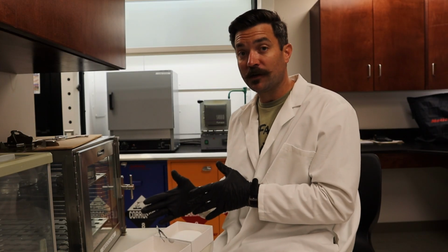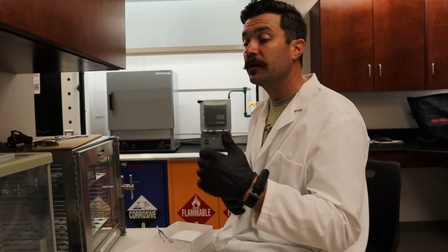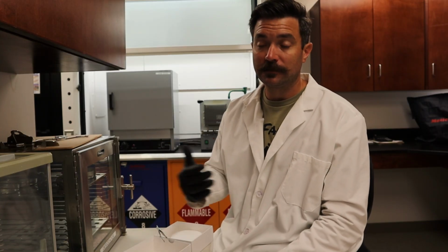Once it's in the desiccator again for another 15 minutes, allowing it to cool in a moisture-free environment, you can then place it back in your analytical balance and have that weight. That weight is actually going to equal your ash weight. And with that number, along with the numbers you got for your MLSS, you can then solve for your volatile range and know your MLVSS.